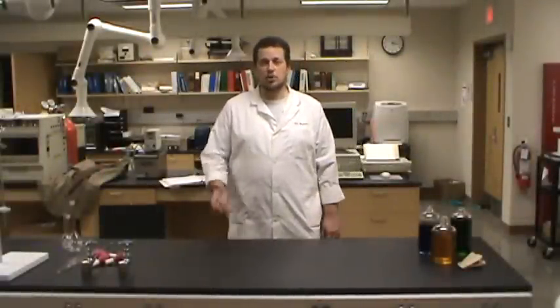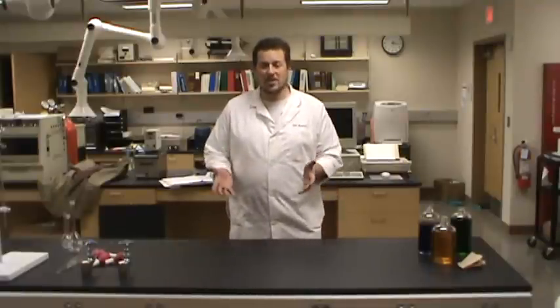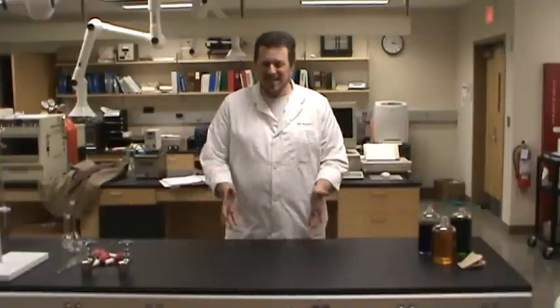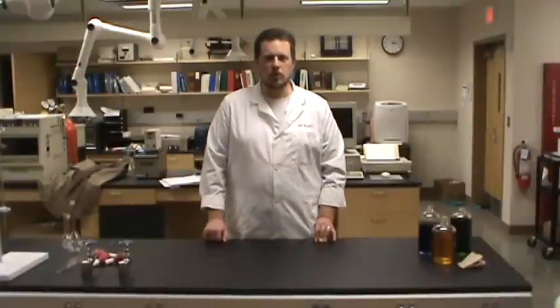We have a wide variety of glassware and equipment that lets us measure liquid reagents in various different ways. The one important thing we've got to do is always think about why we're measuring liquid reagent. If we just need an approximate value, something like a beaker or an Erlenmeyer flask works.